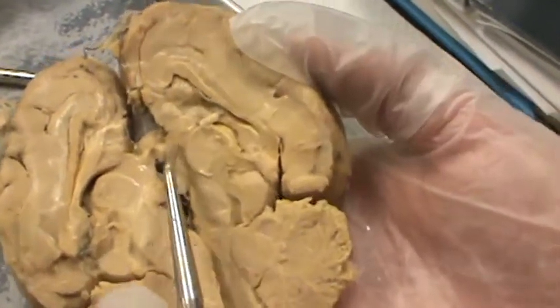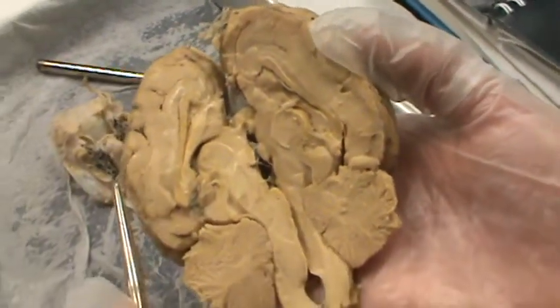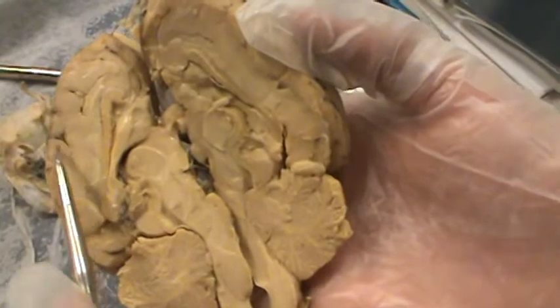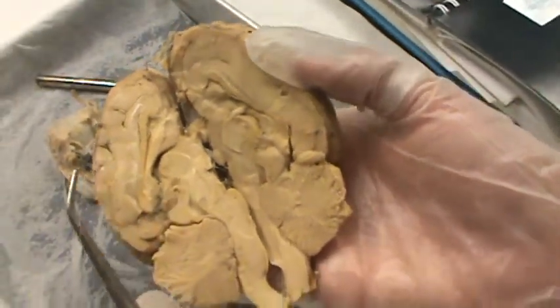The gray matter is the outermost layer of the brain. Gray matter. The white matter is inside of the gray matter. White matter. Corpus callosum.